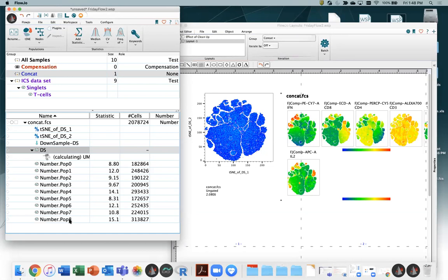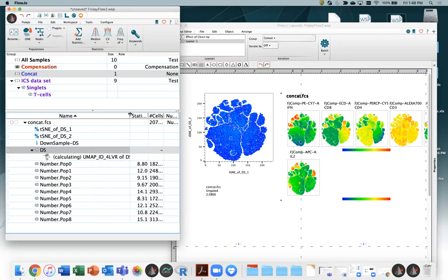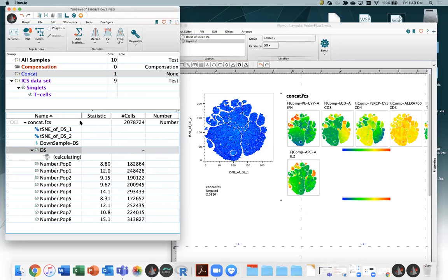And so this is also showing one advantage of t-SNE compared to the others, because it's built in, it's a lot faster. And my impatience with running some of the ones that I have to run as plugins is showing. All right, up down sample, just checking, so good. All right, well, maybe we'll attempt to run simultaneously and hope that it'll calculate the quick things like clustering first.